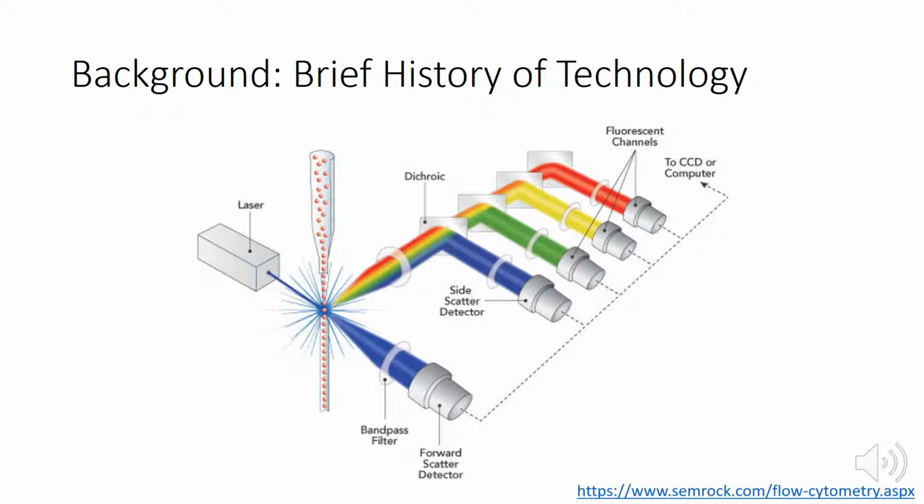Although there are many applications of flow cytometry, the foundation of its mechanism is similar. A sample of cells or particles is injected into the flow cytometer. From here, the sample is fed through a sheath fluid in such a way that the cells or particles of the sample are in a single file line passing through the opening of this center tube. This way, when the sample crosses the laser, the light scattered and detected is the result of a single cell or particle. The light is scattered in two directions, both forward and sideways.